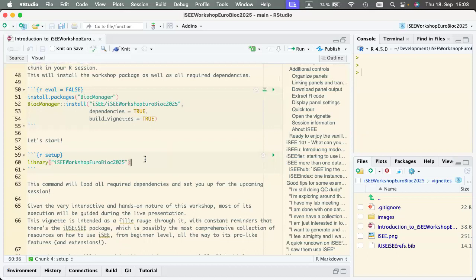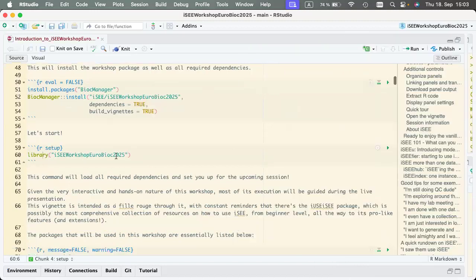So in case you either install the package or you're working on the cloud instance, you could basically load all the dependencies that you need by simply executing this command. Maybe I can have the output inside here. Does it help? Instead of having the output of the chunks inline, and then I can maximize. Yeah, okay.